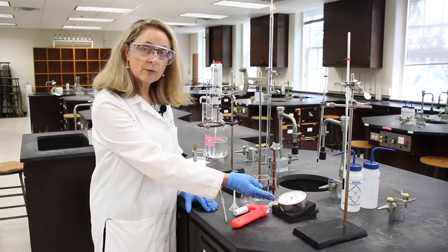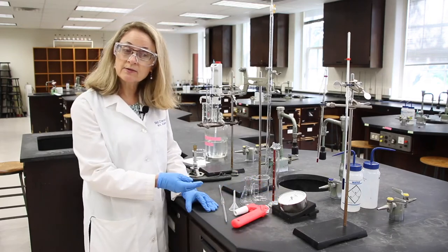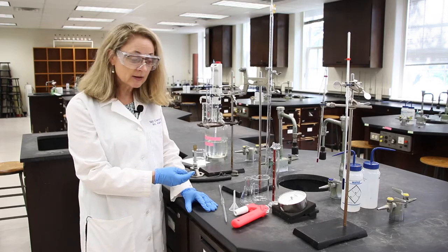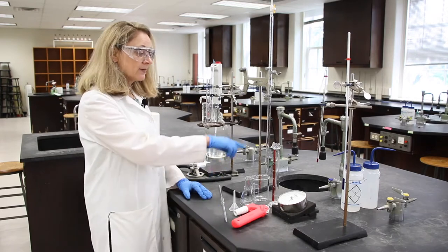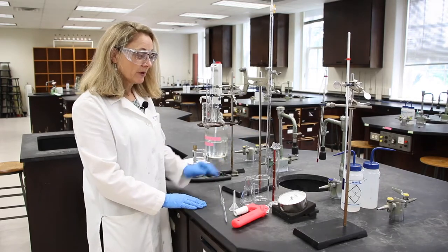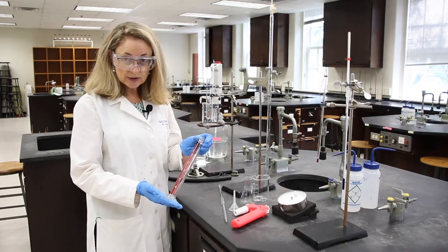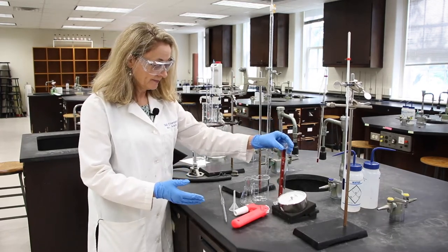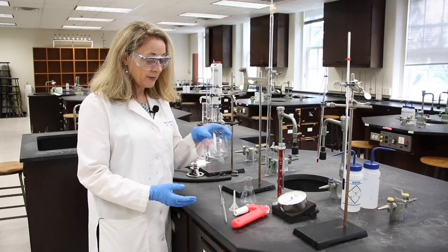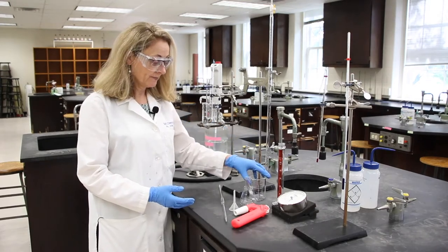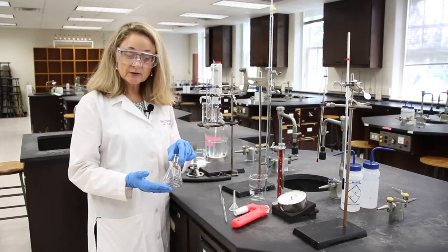We have a barometer, which will give us the pressure in the laboratory. We have some measurement equipment. We've got a graduated cylinder, a beaker, an Erlenmeyer flask.